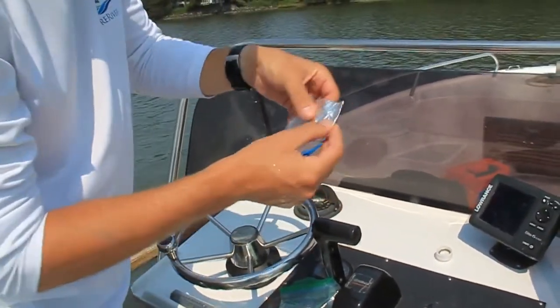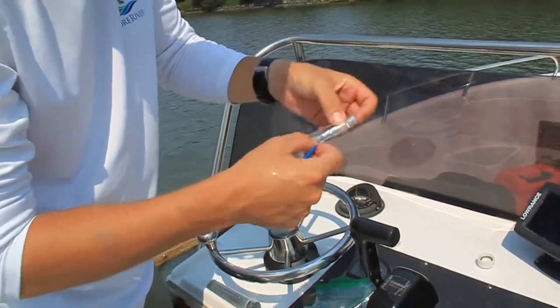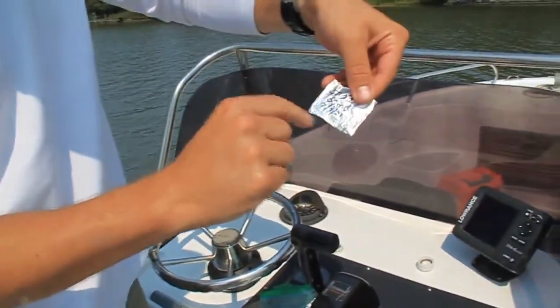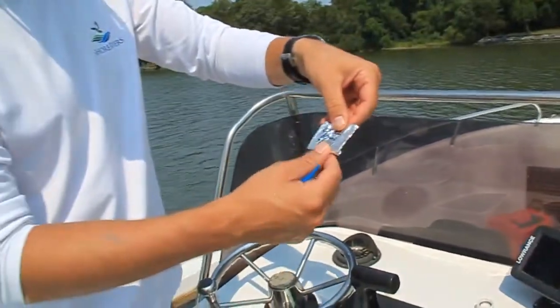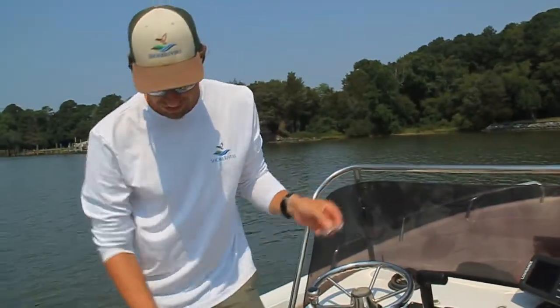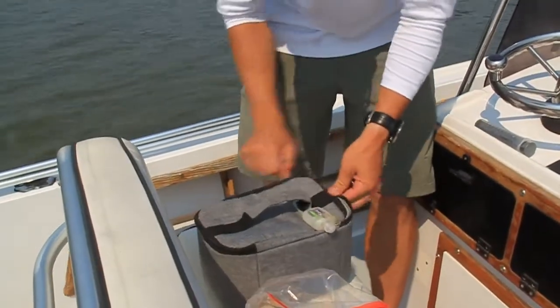Go ahead and seal up the sides on each side of that so when we put it on ice, nothing gets in there. And then on the label, or on the foil itself, I have the site identification number, the date, and then what's important is how much water we push through that filter to collect that material. And so we put 60 milliliters of water there. And so this will, again, go on ice as soon as possible to help preserve that sample.